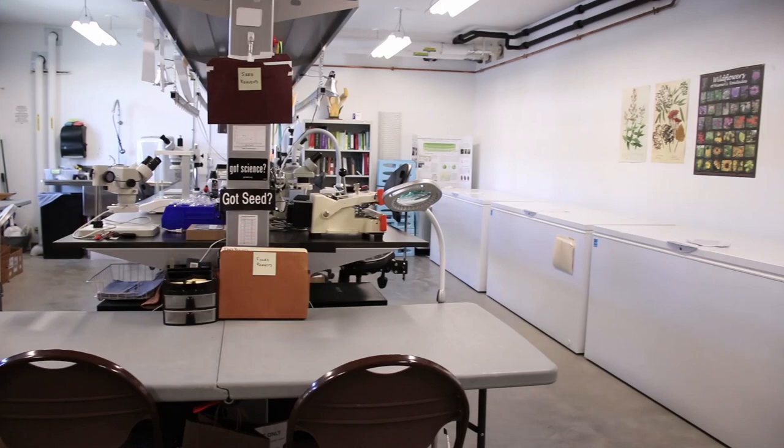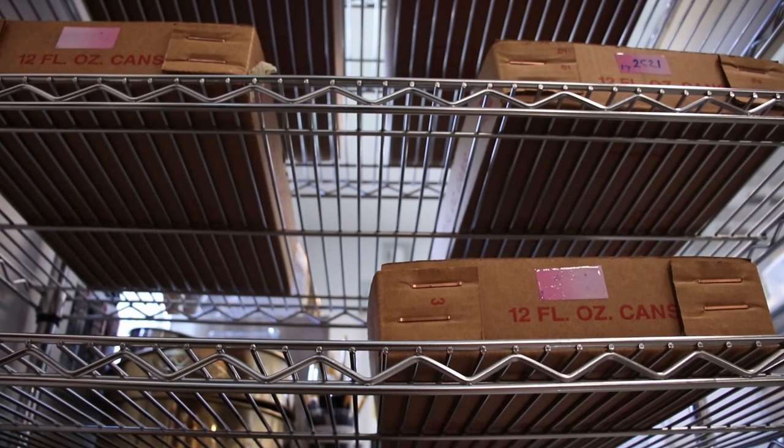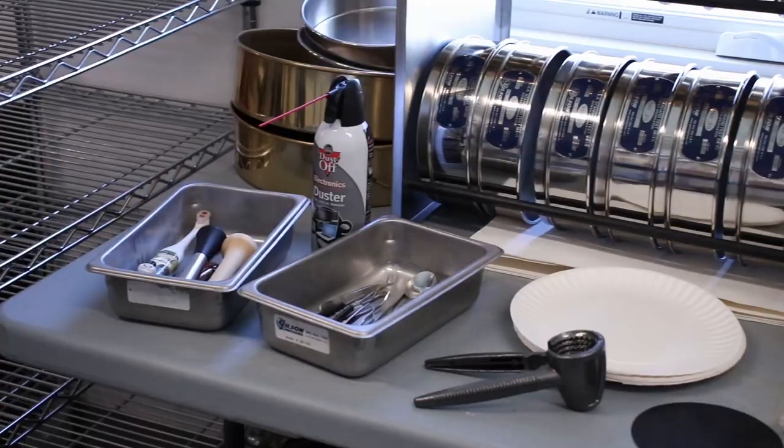We label and put them into cardboard flats to prevent the seeds from getting moldy. They will wait here on the wire rack until they're ready to be cleaned.